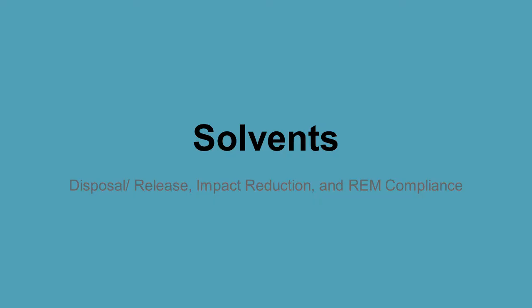The goal of this presentation is to cover the disposal and release, the impact reduction, and the REM compliance with regard to solvents used in the lab. We want to make it clear that we're providing suggestions, and we want you to take these into account with your personal research in mind.